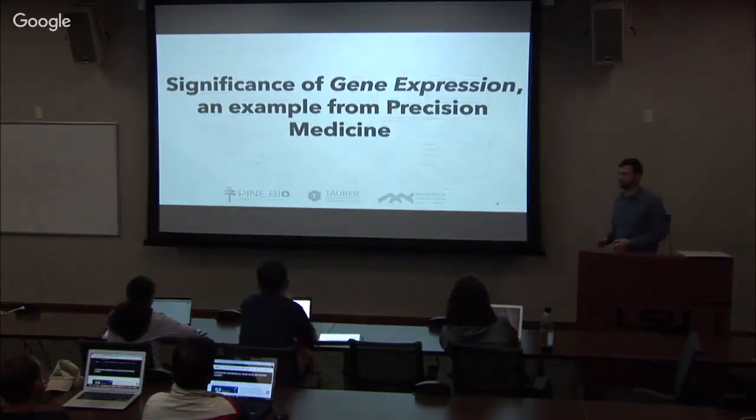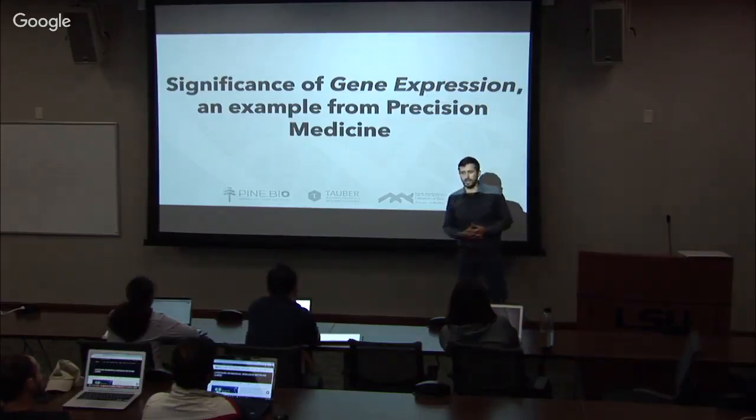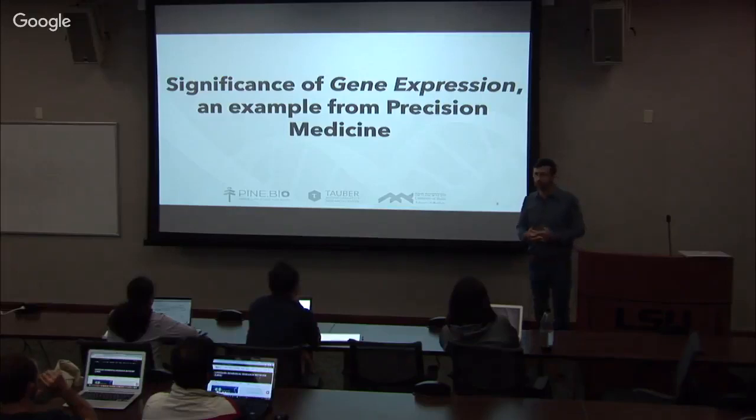Now, before we jump into that, in the online modules, we will be primarily using a data set from a publication on patient-derived xenograft models, PDX models. But in this session, I will use a different data set.